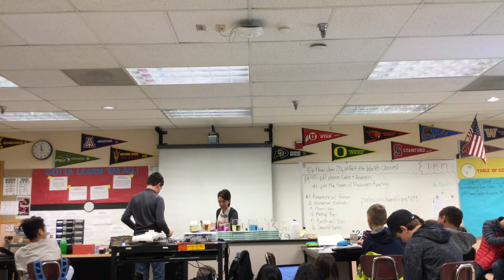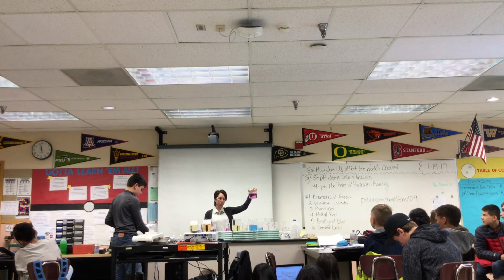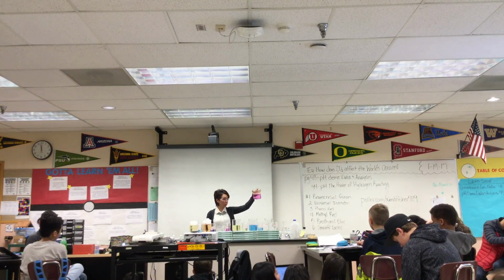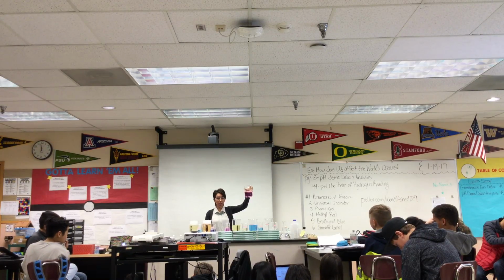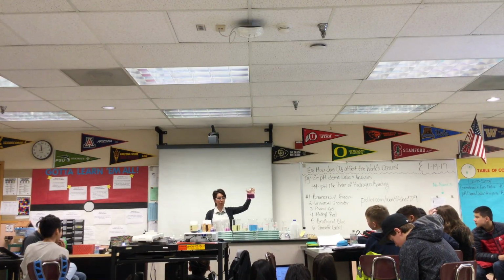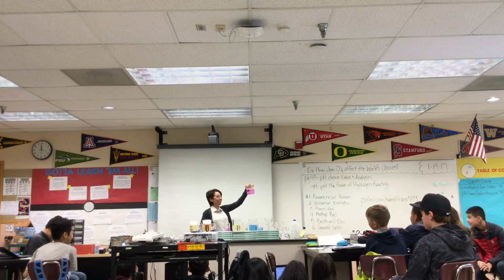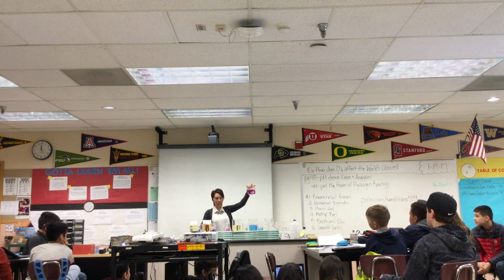How would you guys describe this color? It's not really red. Pink. I've heard some people argue magenta and fuchsia. You can pick whatever pink shade you decide. Fuchsia is just a fun word to write down if you decide you want fuchsia. You can also combine those words and make your own color. All right, if it is going to become more acidic, what color is it going to turn?